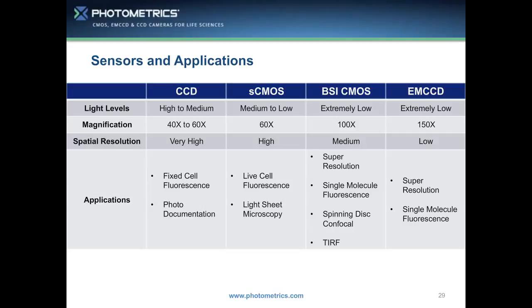And it's not like EMCCDs are now defunct. It's not that they've been completely replaced and are now ancient technology. EMCCD cameras will always be the most sensitive cameras out there: the giant pixels, the near perfect quantum efficiency, read noise of less than an electron. Remember, if the first problem is I can't see my cell and the back-illuminated CMOS isn't quite enough, then an EMCCD will always be a viable option. But for the majority of applications, where light flux is quite low, back-illuminated CMOS becomes a much more viable option. There's no need to shoehorn the smaller pixel front-illuminated CMOS technology into where the EMCCD cameras were previously positioned.